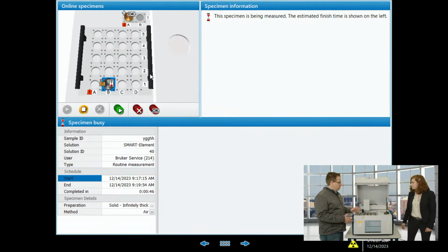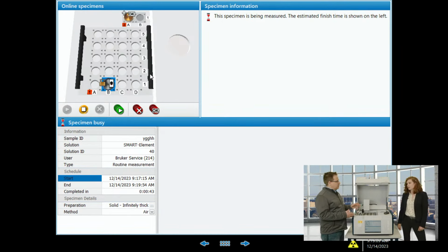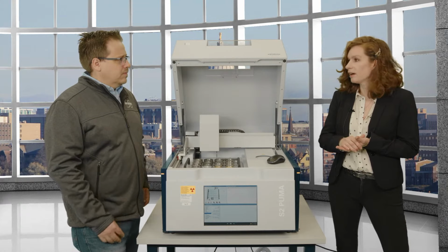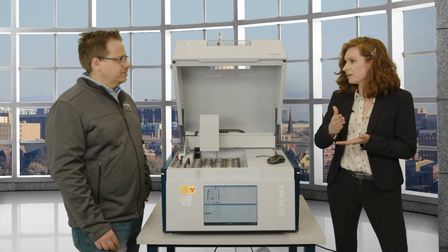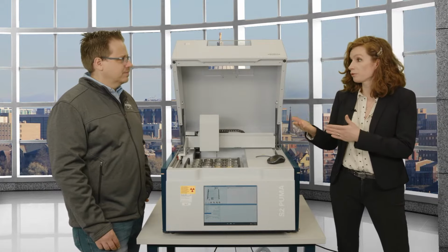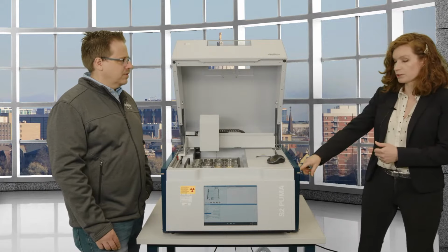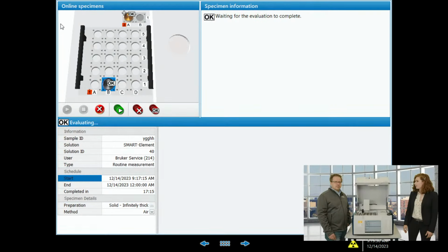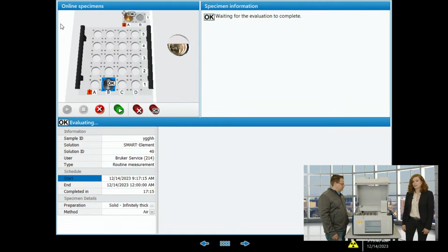So now, how long does a measurement normally take? Is this representative? Maybe we sped it up a little bit. We did speed it up a little bit, but it is still representative. I have measured samples. I have set up calibrations that took about 1.5 minutes, where we just do one sequence pretty briefly, just two elements, and they were all in the same range that we wanted to look at. Because EDXRF might look at different ranges with a filter, without a filter. We just saw the X-rays turn off, right, so that it can open the chamber again. And so 1.5 minutes is still possible.